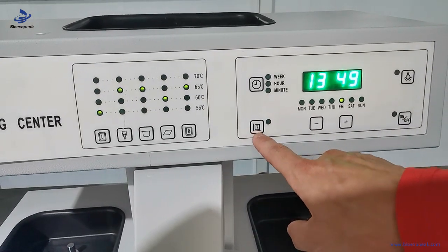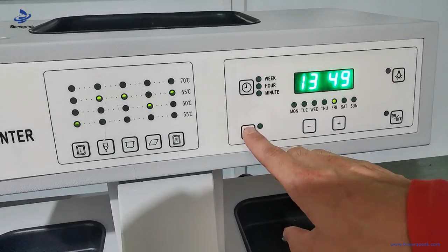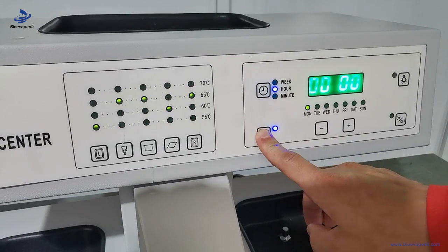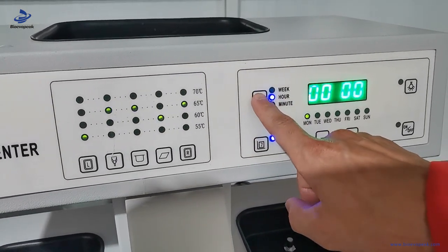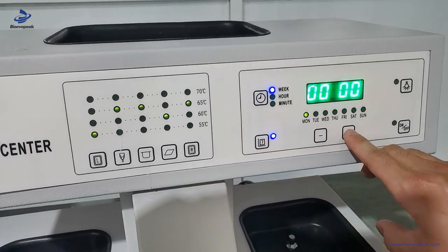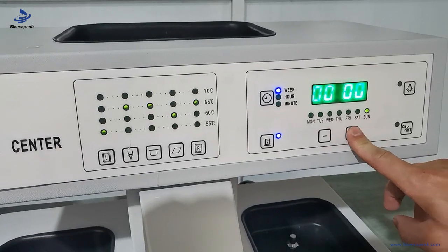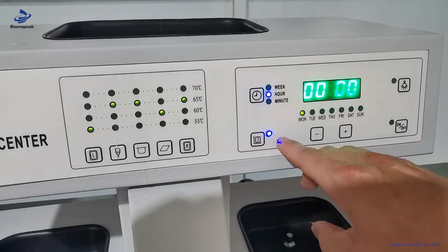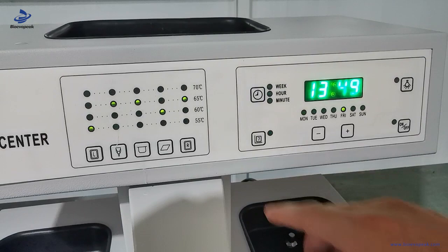Then we set the starting time. Press this key for over three seconds, then go to the week. For example, we let the machine start next Monday. Then go to the hour, then to the minutes, and finally confirm with this key.